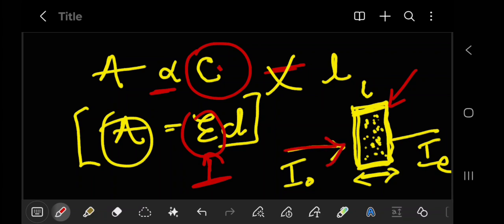And something you should not forget is the units. Don't forget to know the units for each and every parameter. So path length is just distance. So go through this, know the units, and know how to apply them correctly. Concentration is in mole per liter.